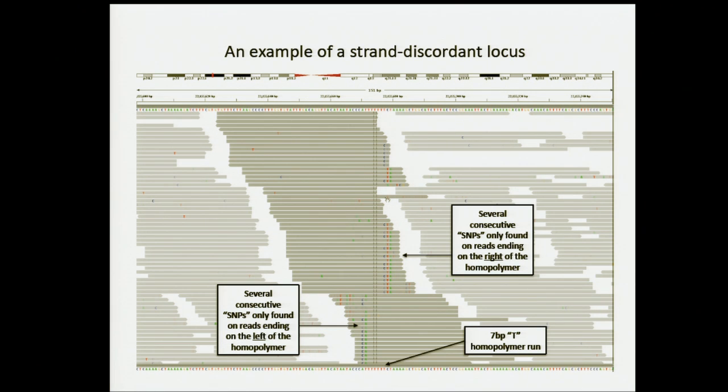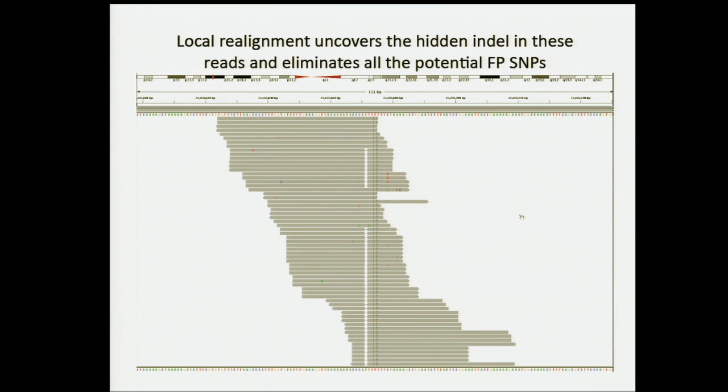But we can go back afterwards and reprocess the BAM and look for cases like this where funky things are going on, they're inconsistent, and they're all clustered like this. This is the purpose of the indel realignment step. It's to go back around these areas that are purported indels, either because some of the reads have already aligned with indels, or there are these clustered regions, or there are sites of known variation, and realign using some Smith-Waterman hybrid to fix the BAM like this. Okay, so this is the purpose of this step.